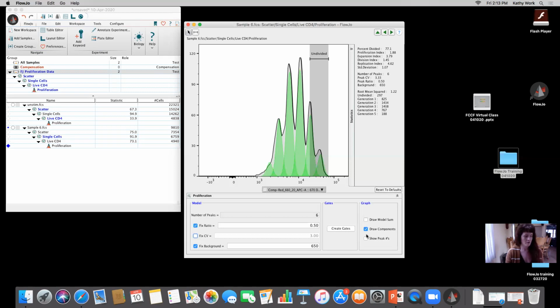Right. And if any of these are more or less sensitive to fixation? More or less sensitive to fixation. Okay. That I'm not super aware of. I'm not sure if anyone else has experience with that. If they want to chime in, I'm more than welcome to that.